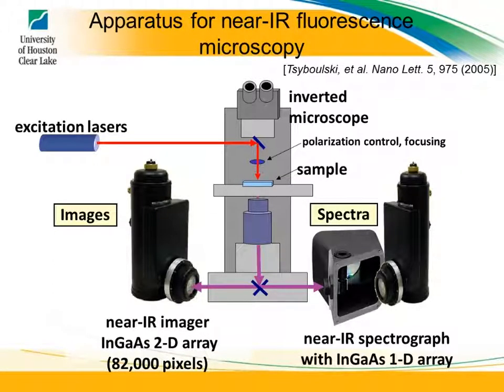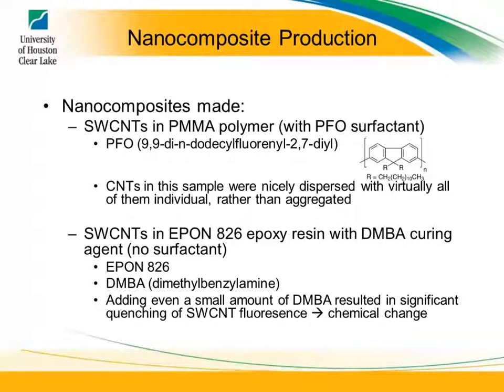I was able to get a spectrograph like that here. So now I can actually look at bulk spectra using that. Well, this is some of the work that I've been doing. I've been trying to put single-walled nanotubes inside materials. And this is an example of nanotubes. They're fluffy, very fluffy. You see the dark in there. I'll pass this around. Just don't open the cap. Probably not going to do anything, but I don't want any wind current to flow and we get nanotubes going in there.